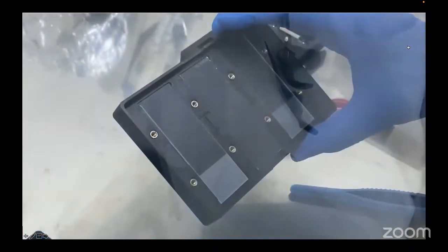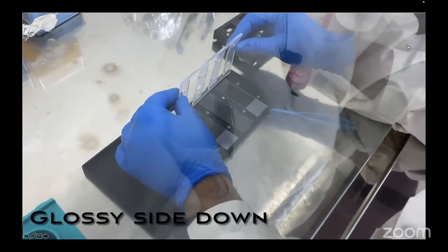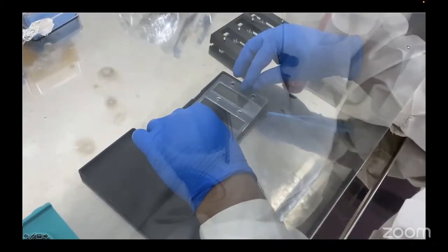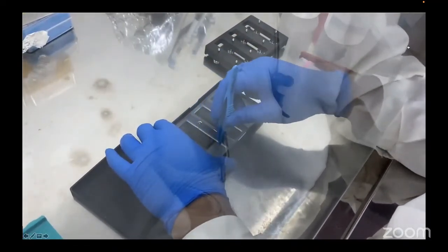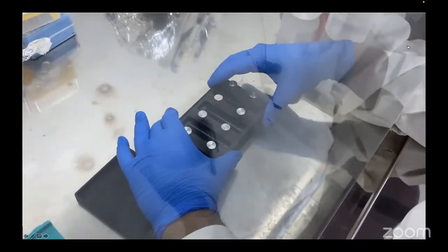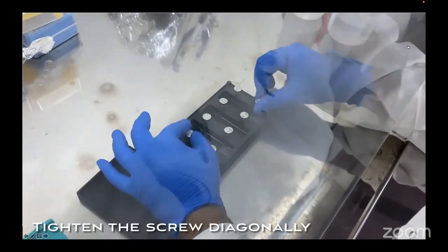Now, allow the gasket to be placed over the slides. Remember to keep the glossy side of the gasket on the downward side. Align the silicone gasket over the slide and tightly seal the incubation chamber using the screws. Remember, tighten the screws only diagonally. This will ensure that the slides do not break.